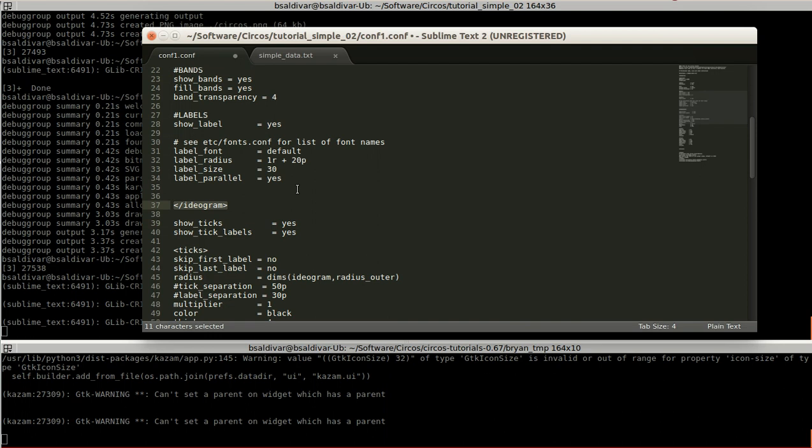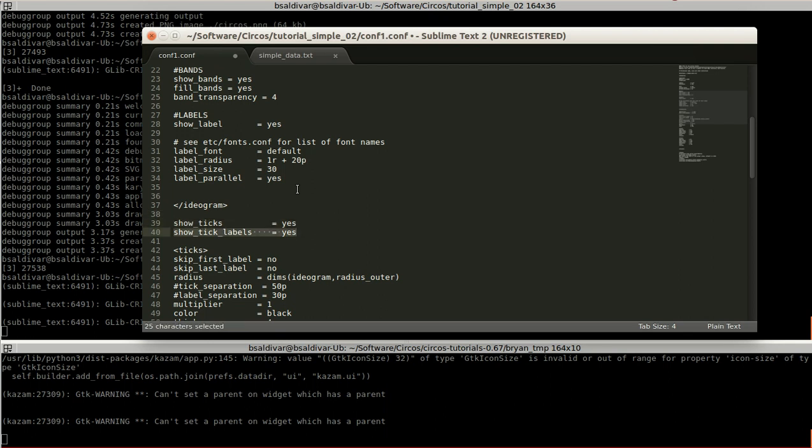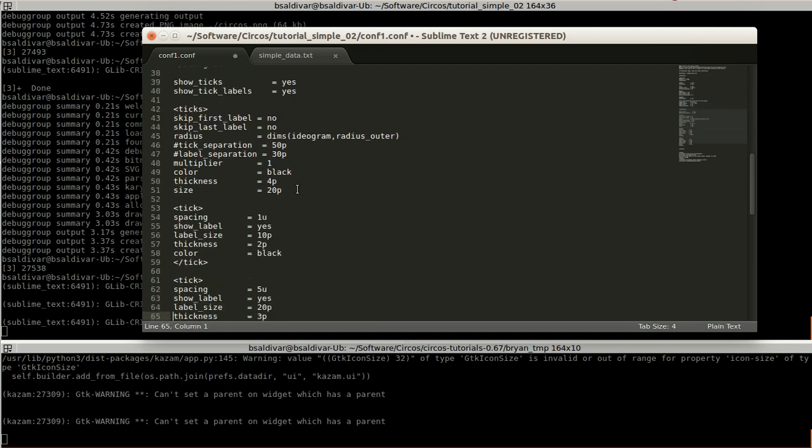So you have to see that below or out of the ideogram, I have specified these two lines. Show ticks, yes. And show tick labels as yes. Show ticks are going to be those ticks that go out of the graphic. And the labels are going to be those numbers that represent each division.